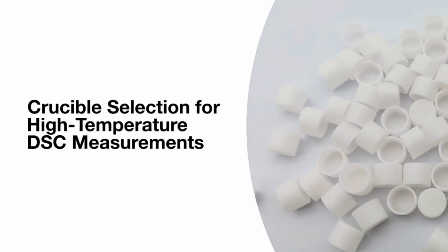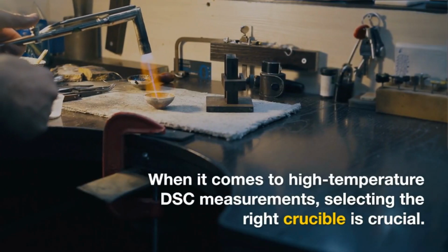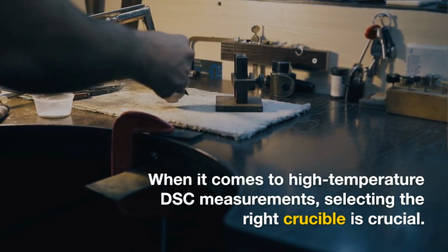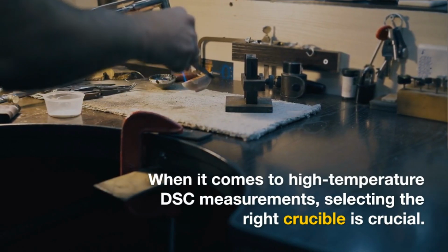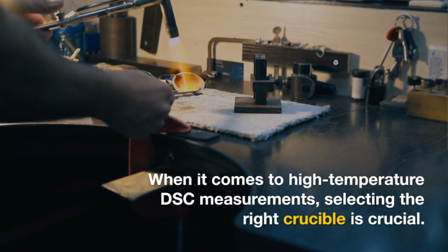A suitable crucible is vital for obtaining accurate and precise results in high-temperature DSC measurements. The properties and characteristics of the crucible significantly impact the thermal behavior of the sample material. Therefore, it is essential to consider various factors before making a selection.